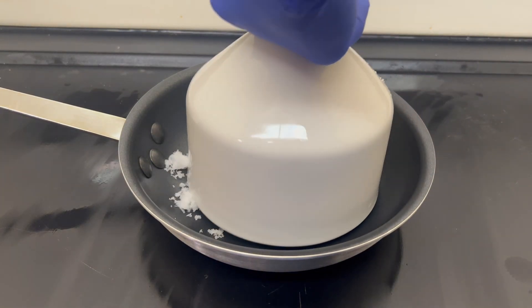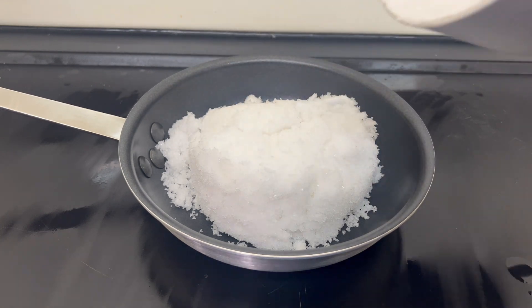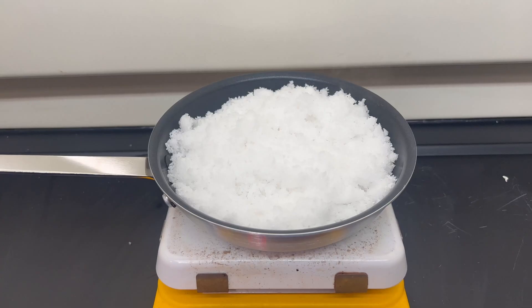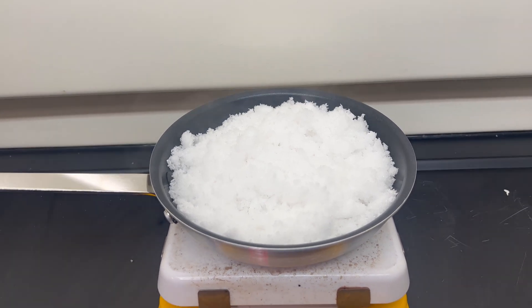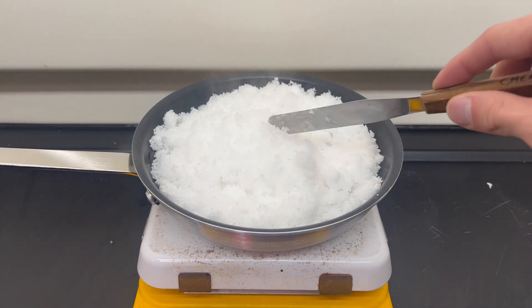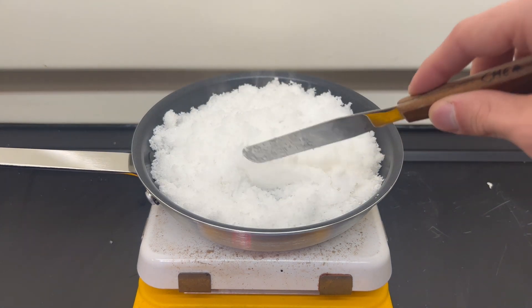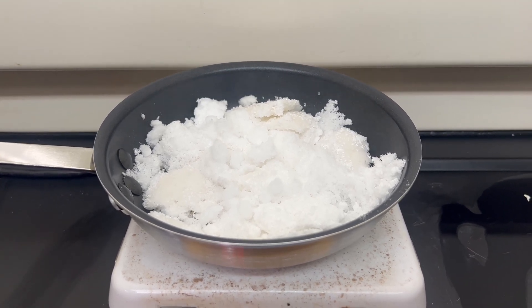The next step is to turn the boric acid into boron trioxide. To do this, the boric acid is heated above 530 degrees Celsius. Heating decomposes the acid. I place the boric acid onto a pan and start heating. Boron trioxide is quite sticky and will ruin any container you use. It's also caustic to glassware. I used a non-stick pan, which worked great.